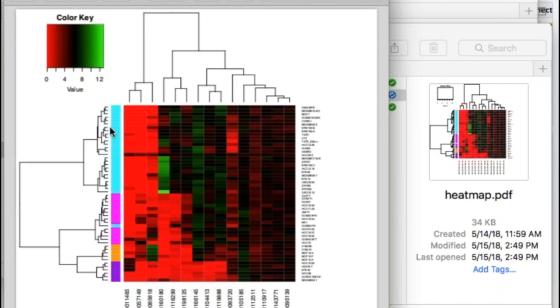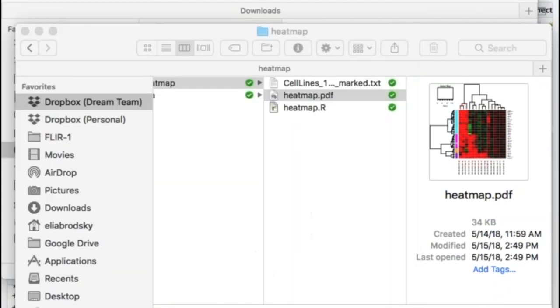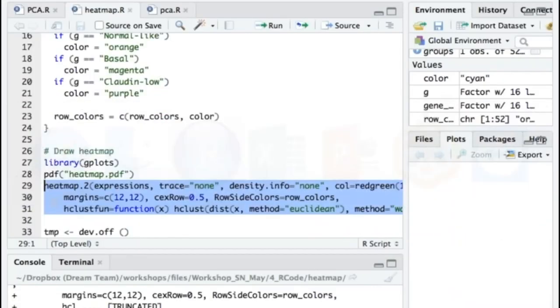Here we have some hierarchical clustering, which orders these rows. And here we see some groups that are all red. Here we see green, and they are all sorted in the proper way. So let us see how it works, and which options do we have? Okay.